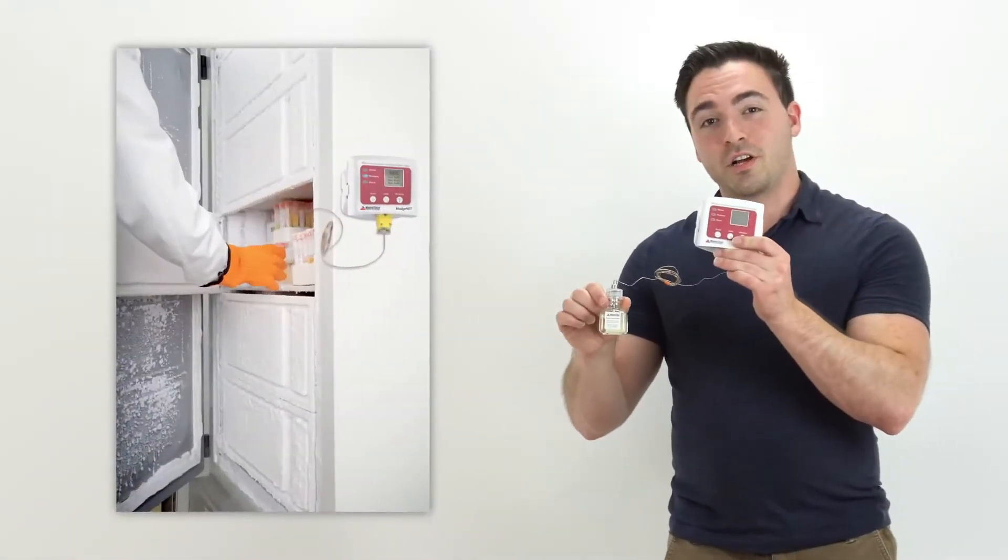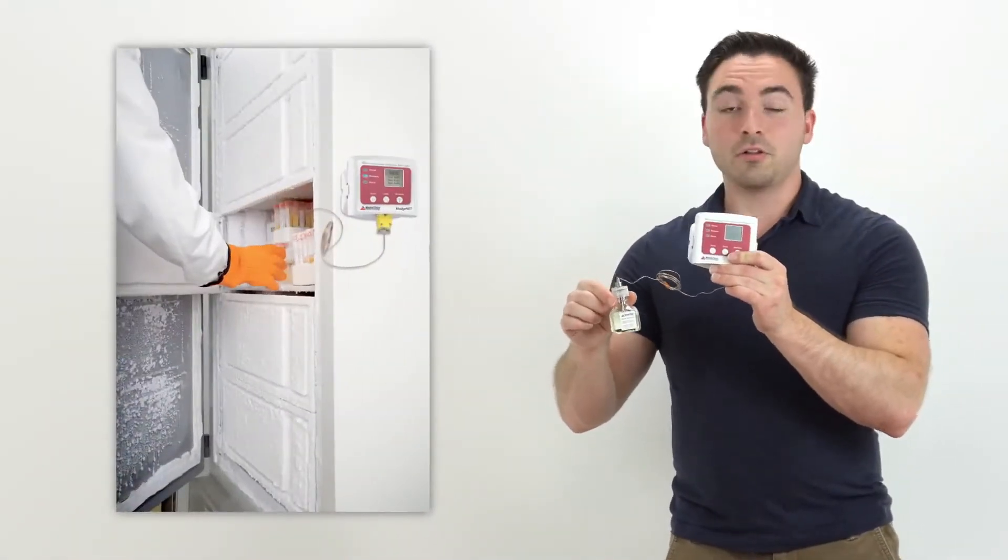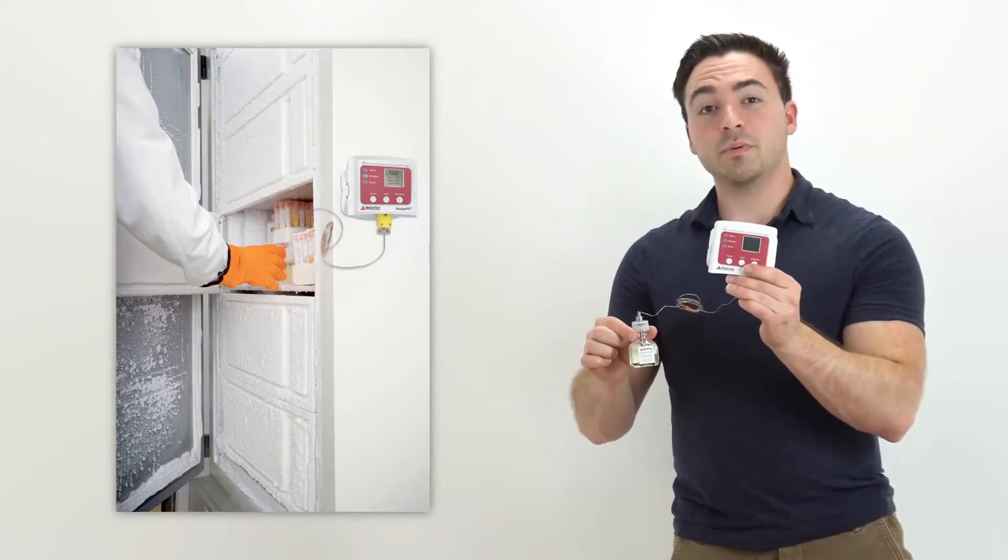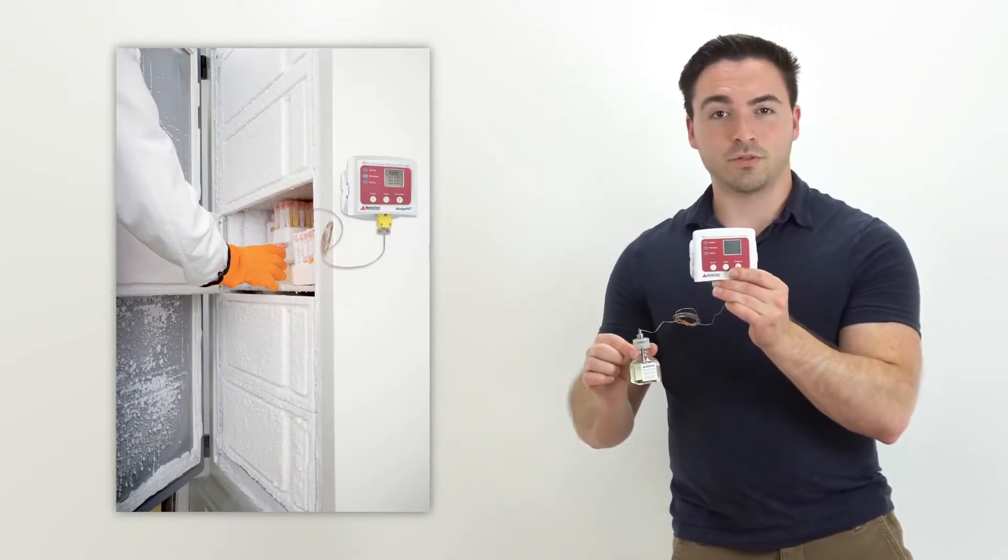By monitoring temperature fluctuations within the filled glycol bottle as opposed to simply the ambient temperature, the device is able to more accurately mimic the experience of vaccines and other pharmaceuticals.